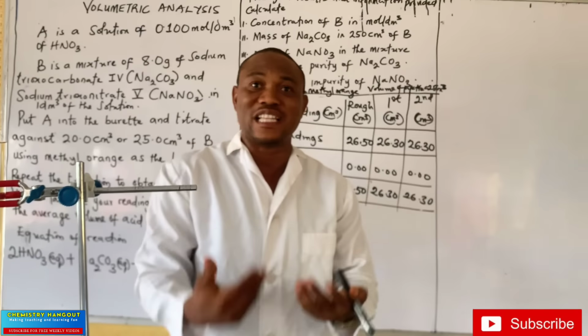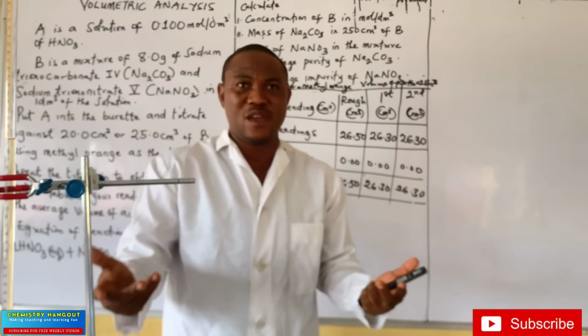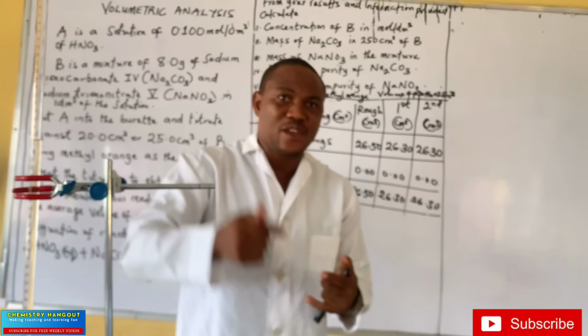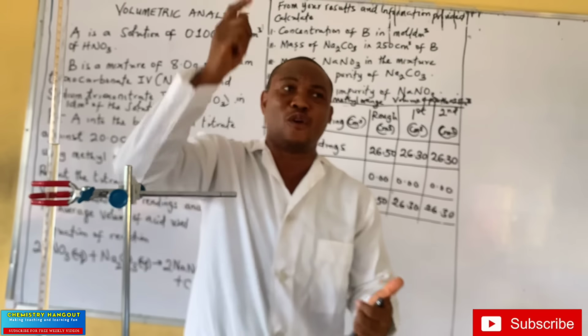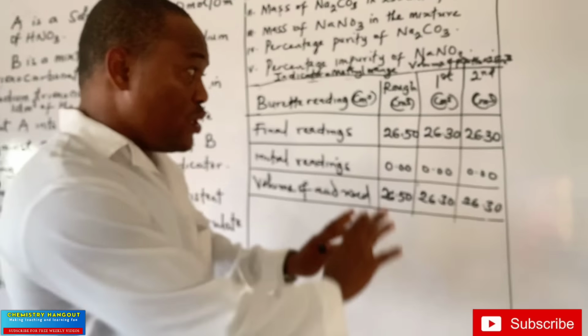You can do it 2 or 3 times because you might not actually be perfect in titration, but I don't just want to waste a lot of time. I'll be doing a lot of titration on this channel. Check every one of our videos every year. We are always dropping videos on titration for NECO and WAEC. So I don't want to waste my time. That's why I'm doing this.